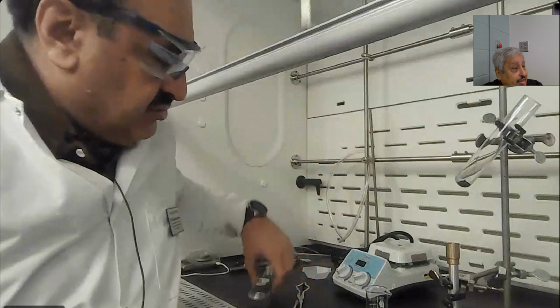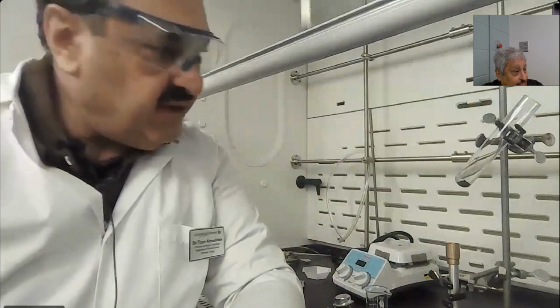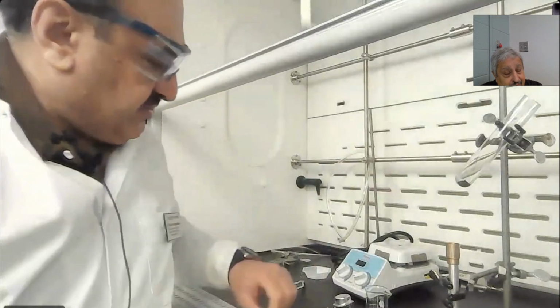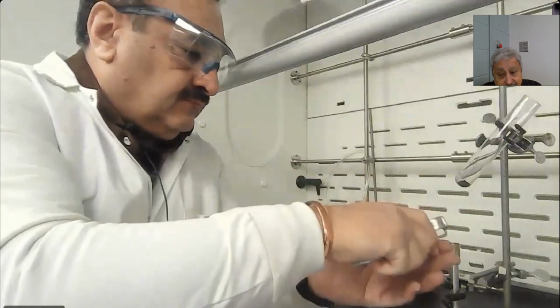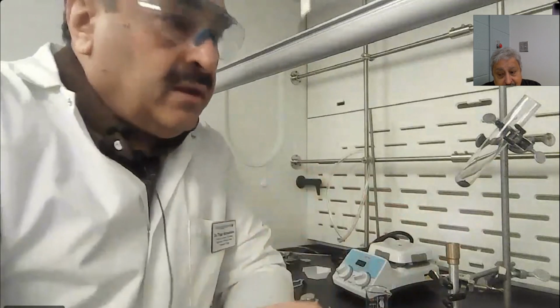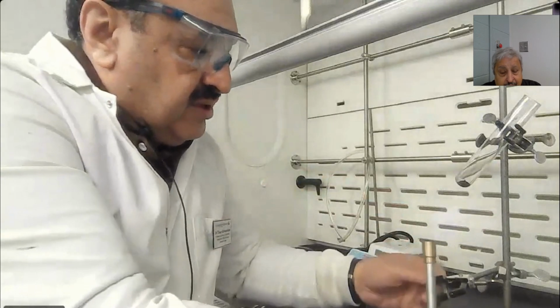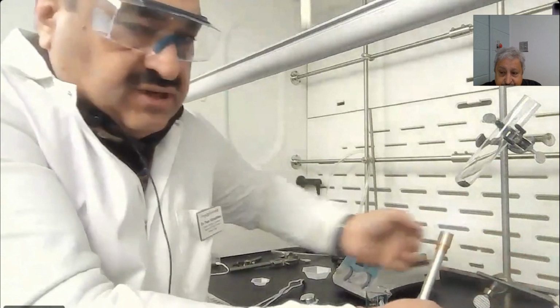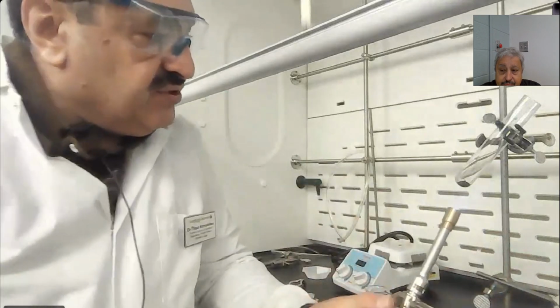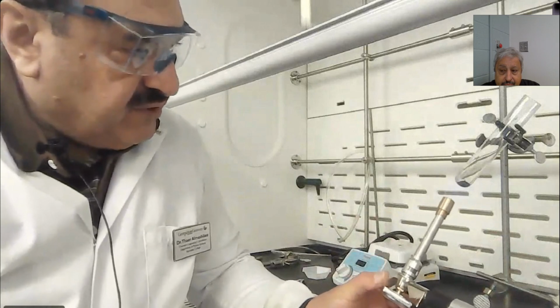Now we need to heat it. How many minutes? 5 minutes. That's the manganese oxide, no mixture inside, for a certain time, 5 minutes only. Let's take about 5 minutes. Spark the Bunsen burner. Make sure your burner has the blue flame. Then put it like this. Try to put the top of the flame at the bottom of the test tube.